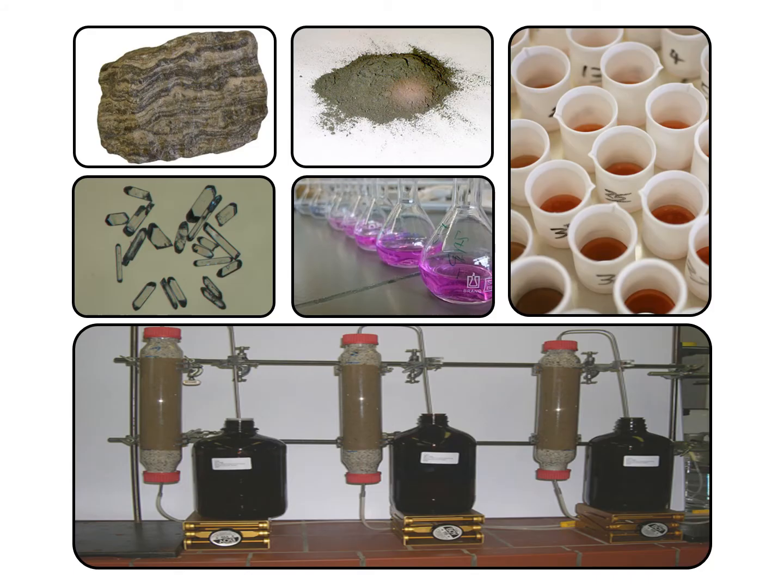Right, so ICP techniques, we'll come on to what that actually is later, are a group of geochemical analytical tools that allow us to measure usually bulk samples. I think you guys have been down to the ion probe and the SEM, things like that. Those are techniques where you want to measure spot analysis, so you want to measure the spatial variability in the chemistry or isotopes in the sample.